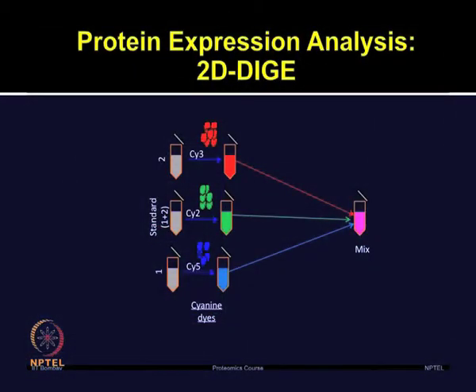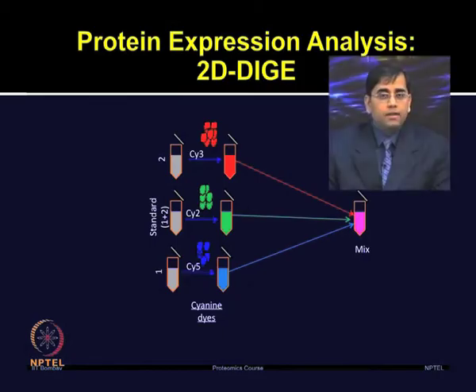So, they used the patients with two different grading system based on the Gleason grading. The Gleason grading system is used to help evaluate the prognosis of men with the prostate cancer. So, depleted serum samples obtained from the patients with Gleason score 5 and Gleason score 7 were used for comparison and further analysis.